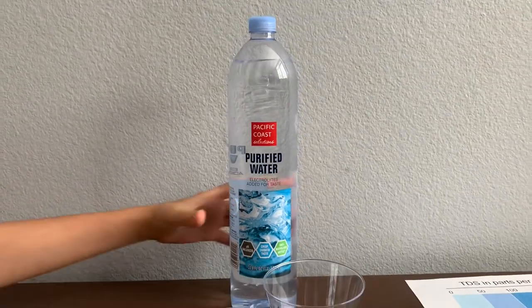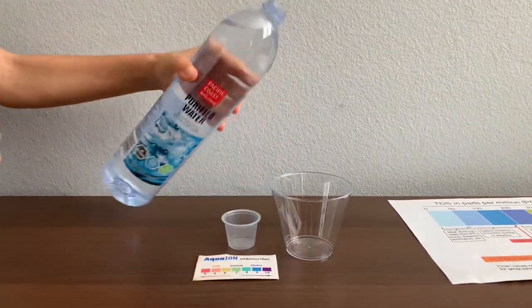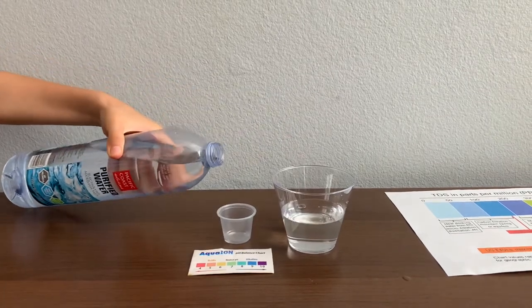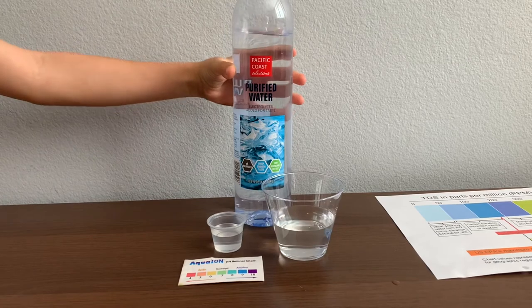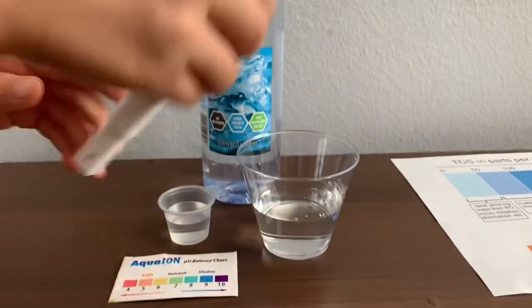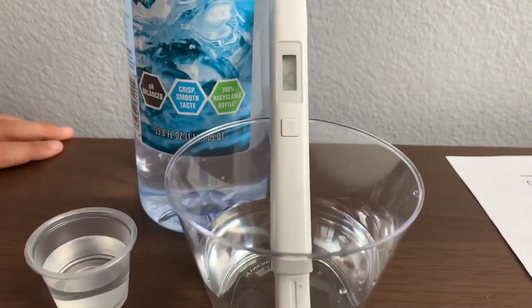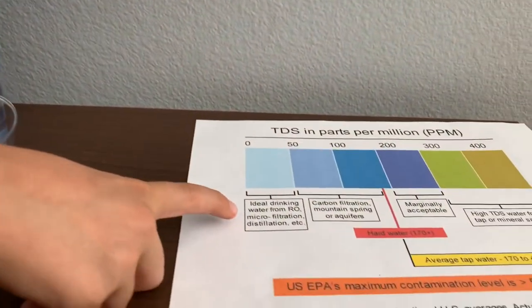Let's test the pH and TDS. Let's pour some water in. First, we're going to test the TDS. Turn on the TDS tester, make sure it says 0 and put it in. The reading is 25. That is microfiltered distilled water.